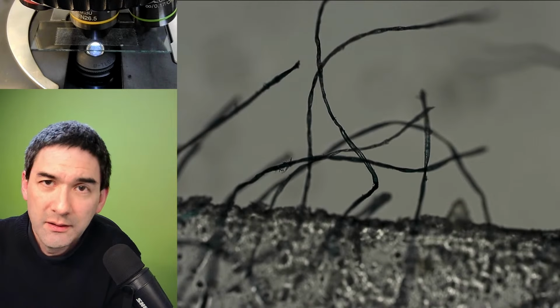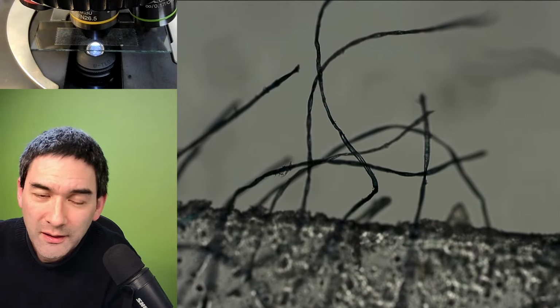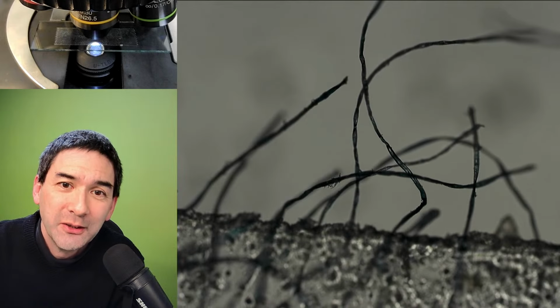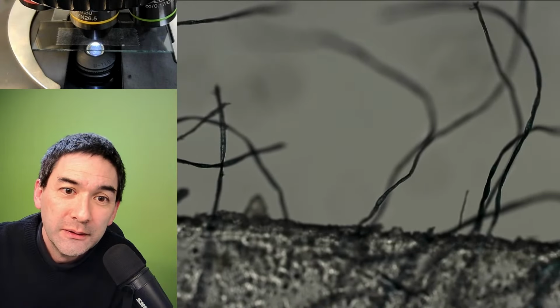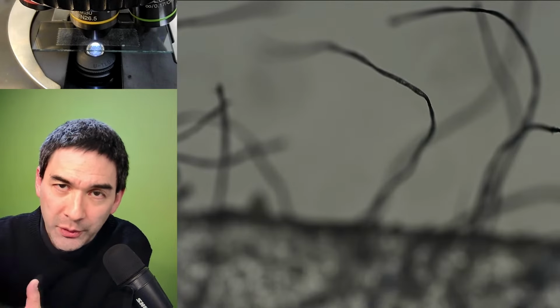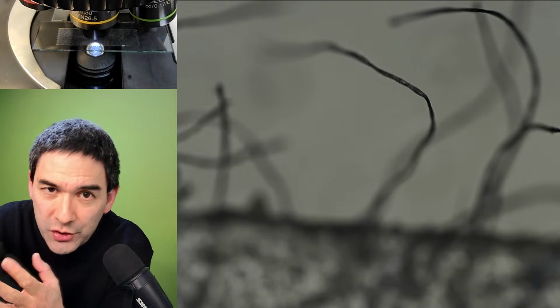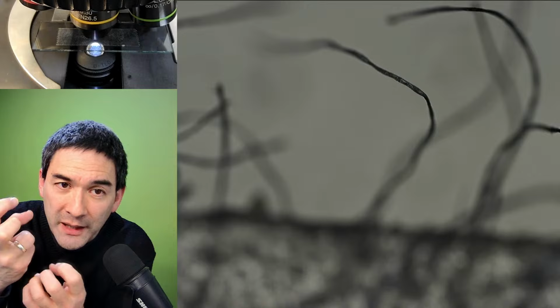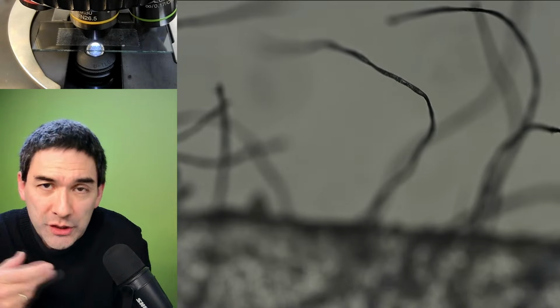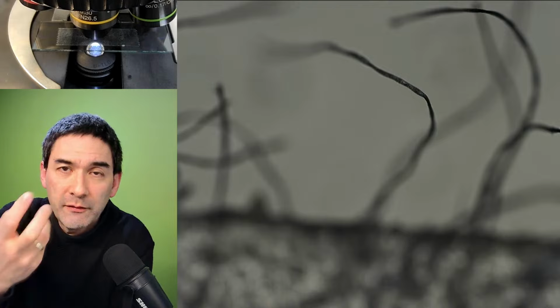Sometimes it's just dust. Look how cool they're moving, right? And they're moving even after I've blown on them. The reason is that they absorb my moisture. It's also a sign that these are natural fibers. My jeans are made of cotton, right? So they're absorbing the moisture.